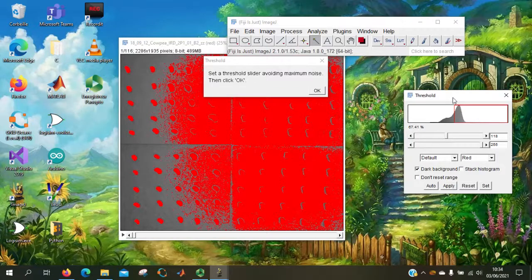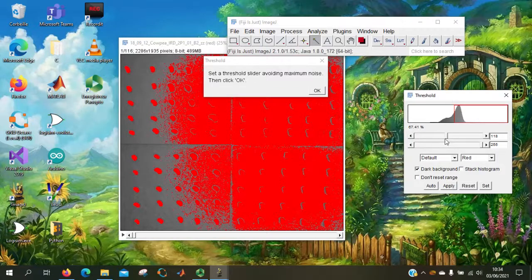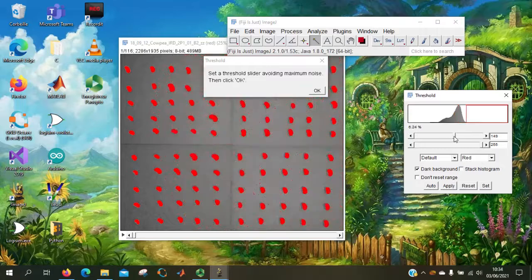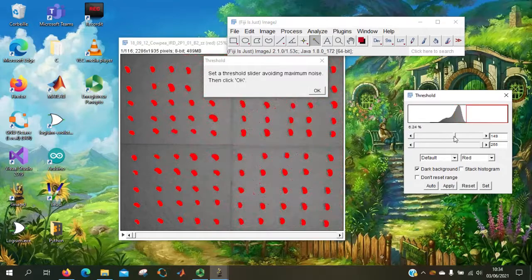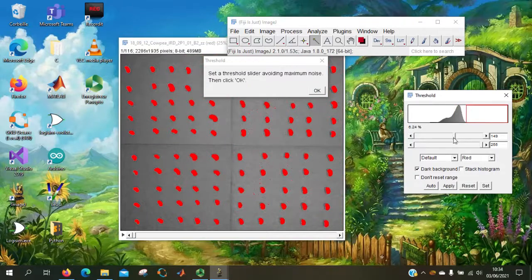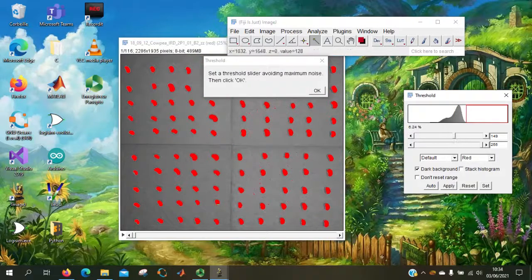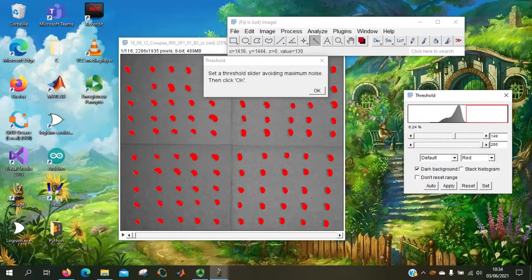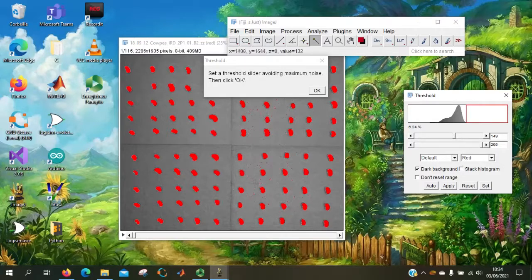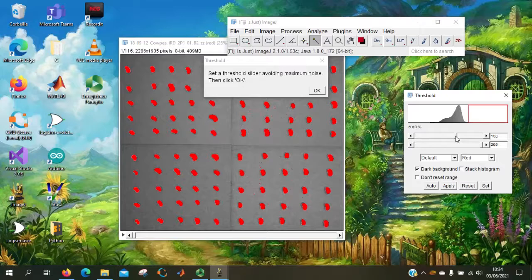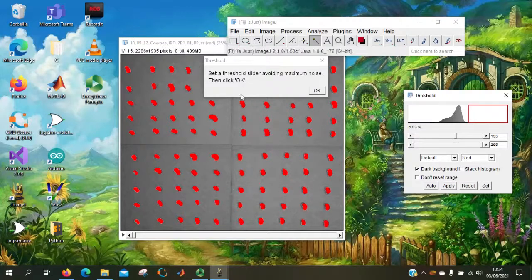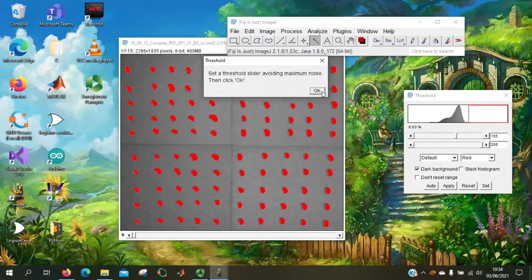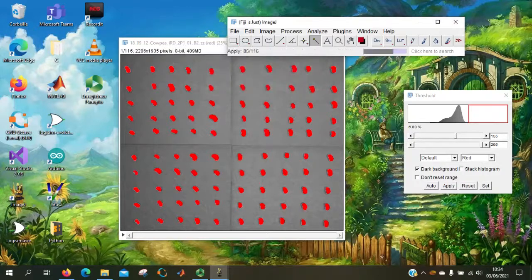Here it asks the user to set the threshold. So we can set the threshold here. To keep only the seeds, we have to avoid the maximum of noise. So here we got almost no noise.